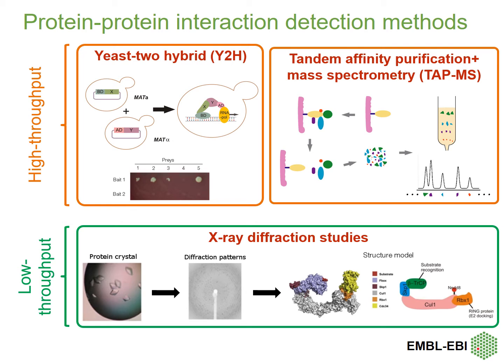Proteins can be made into a crystal. It's frozen in space in a three-dimensional way. And then you can hit it with X-ray, and it scatters, so it's kind of like a bullet hitting and all the fragments scatter. Well, all these X-ray fragments scatter, and you can figure out the scatter, and that can be translated into a structural shape where all amino acids are sitting in a frozen condition.